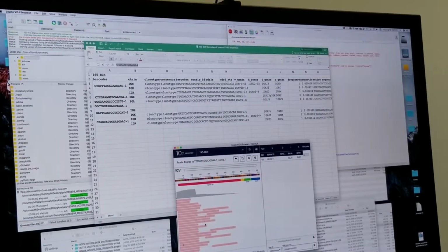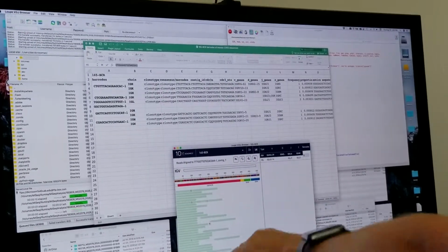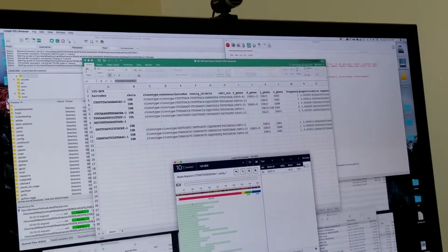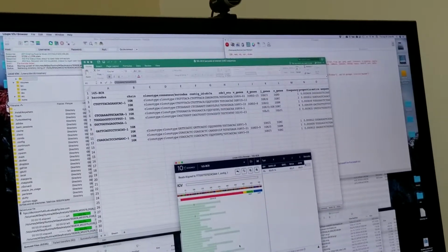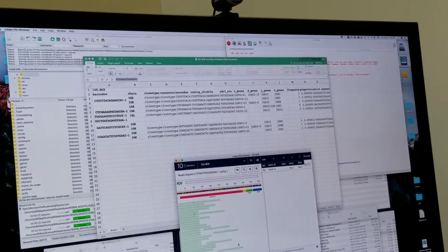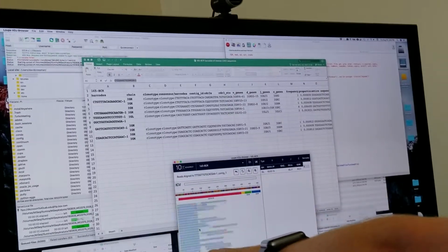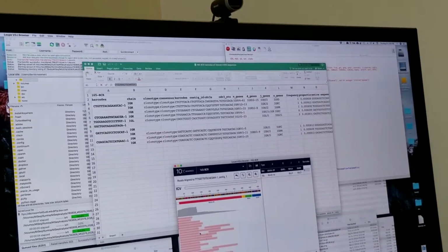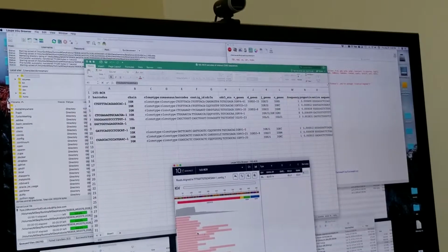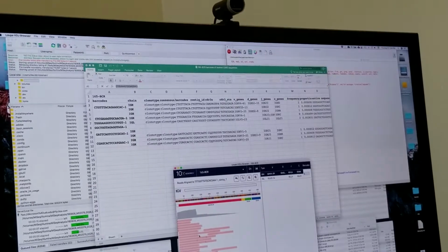As you scroll down, you see that most of the reads are over here on the 5' end, and you don't see very many at all over there. Nobody's done this, I'm pretty sure. And now we get the bad news that it's really 5' bias. It says there's 199 reads, so 200 reads depth coverage at least on the 5' end. So, we'll ask Fred. Yeah, you need to ask the 10X folks. I'll go back and look at the protocol and what they say.